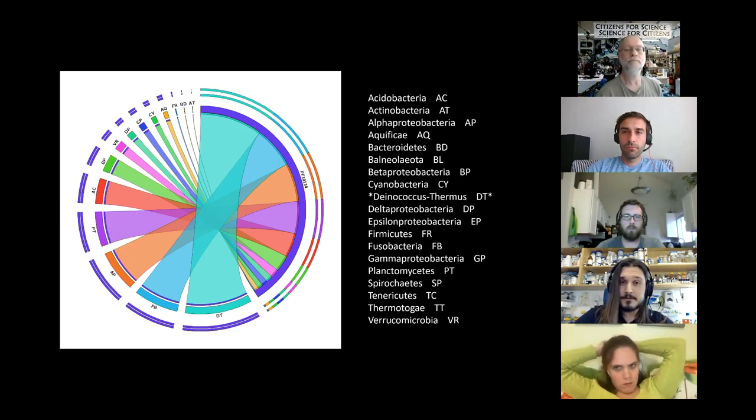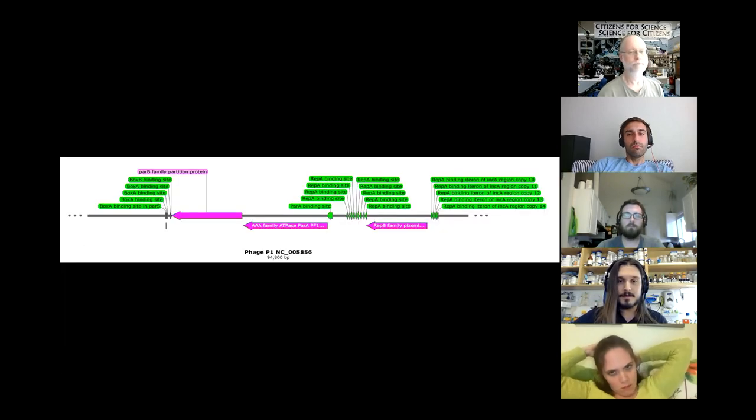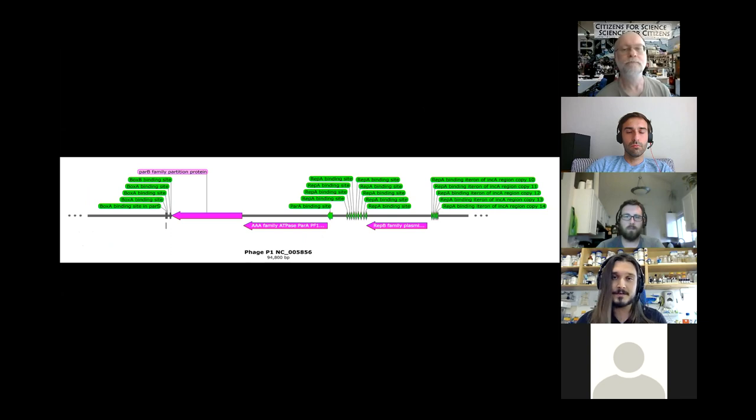So we started digging even further, looking for actual phages that have our replication system. And we scoured all of the reference sequences of all known phages that have been published. And the first thing we did was also compare it to P1, right? So P1 prophage was identified in E. coli. And that's the model for prophage understanding. Like I said before, it had the same type of machinery. It had these many repeat sequences next to a PAR A and a PAR B, but it used a different replication protein, even though it's in that same rep, PAR A, PAR B motif.